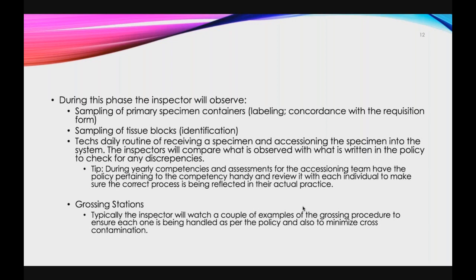One way our lab meets this criteria is we color coordinate each of our grossing stations, and at every station supply them each with their own scale and their own set of utensils. This kind of eliminates the whole back and forth, especially if you only have one person who's grossing and they're going to be doing frozen sections and cutting at the main station. And if it's all in the same area, which my lab is, it's all in one room, sometimes you don't mean to take that forcep and then you go to cut a frozen and you realize, oh, I never washed it.